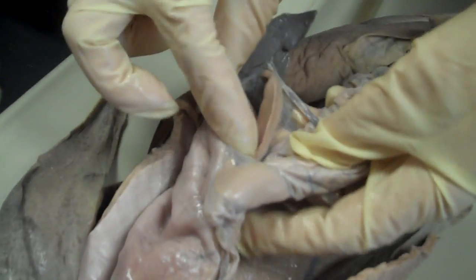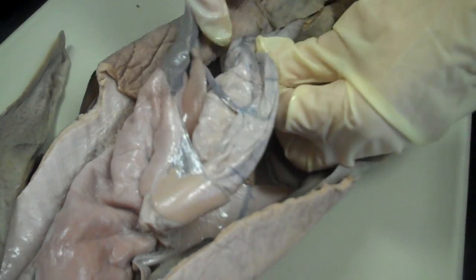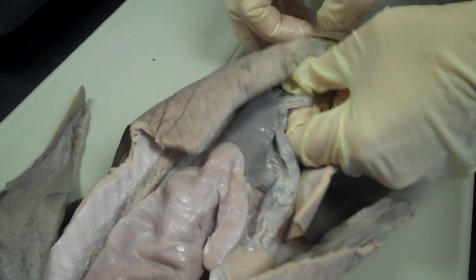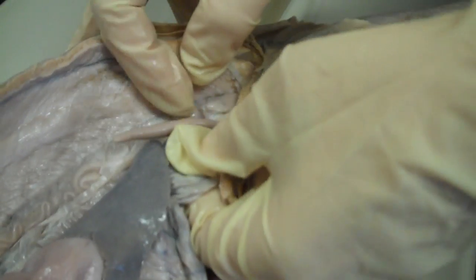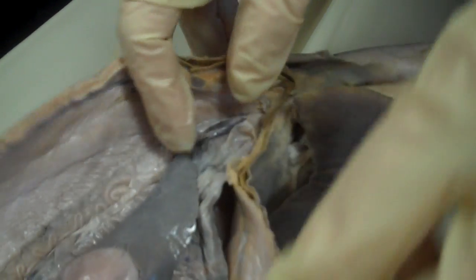There's two lobes, this round one here and this long one in between. Follow the spiral intestine down to the bottom, and this would be the rectum. Right beside it is the rectal gland that maintains salt balance for the fish.